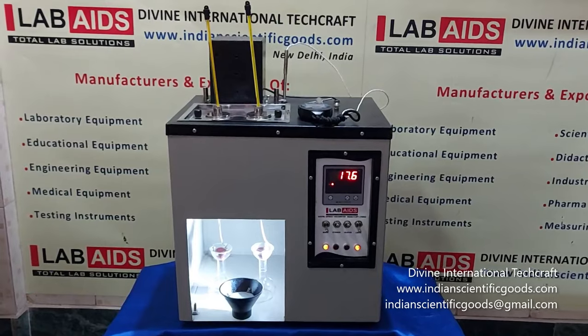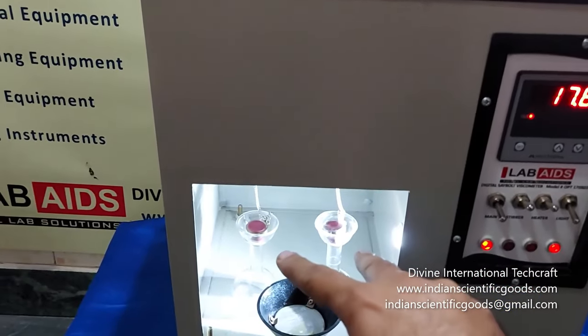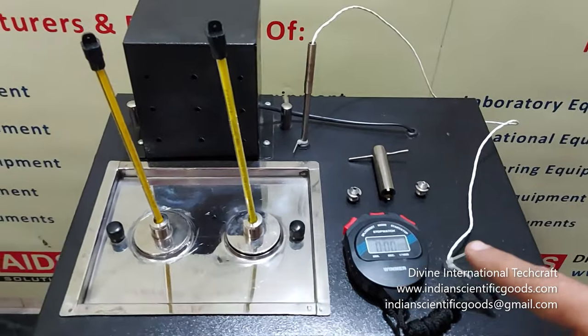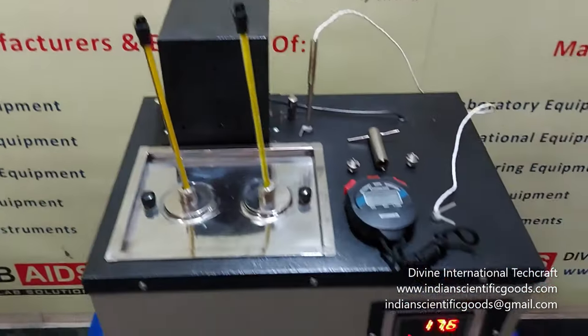Essential accessories included with the apparatus are two glass viscometer flasks of 60 ml capacity and a strainer for filtering. A stopwatch and glass thermometers of ASTM standards may be ordered separately.